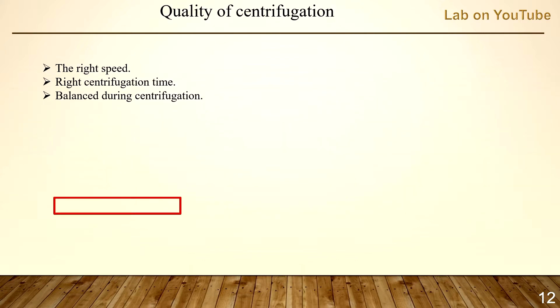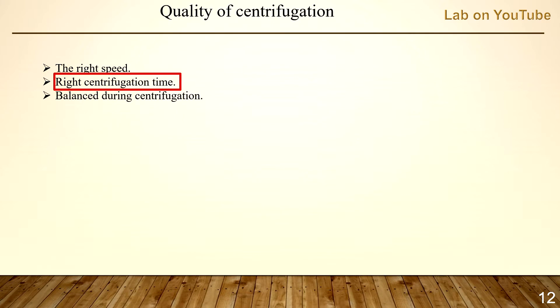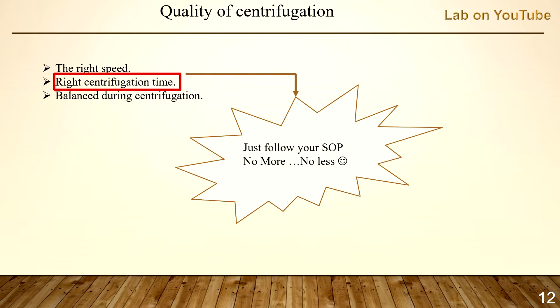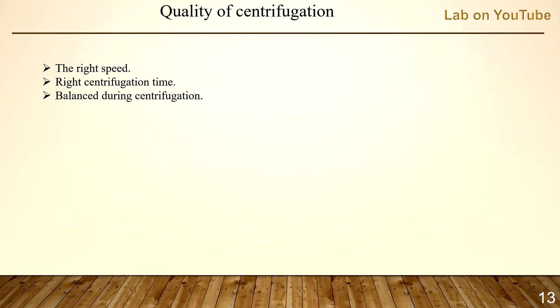The second parameter in quality of centrifugation is time. For time, just follow your standard operating procedure. If it says 10 minutes, no more and no less — even 9 minutes will affect the quality of results. You may see clear serum but not detect silica, fibrin, platelets, or micro clots.